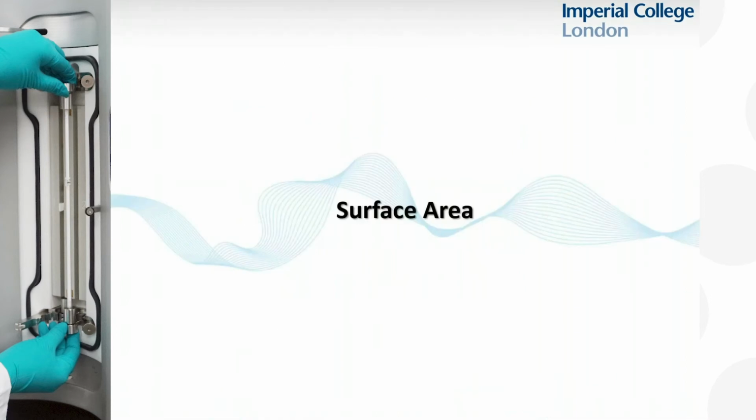So let me talk a bit about surface areas. And one of the most basic properties people would expect to have for any particular material, including pharmaceuticals, is their surface area. And I think it's a sad statement of fact that in many material systems, we often have very little information around the material. We might get a particle size distribution if we're lucky. We might get a BET surface area, possibly.